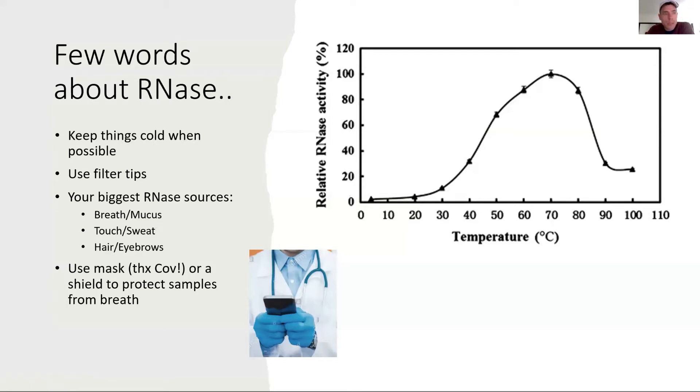For the same reason we use filter tips, because the pipette is blowing in air and ejecting it. If anything is in the air, that will go into our samples. I briefly wanted to touch on the biggest sources of RNase contamination. RNase is part of our breath as well as our mucus and sweat and touch. Believe it or not, there's the occasional hair or eyebrow that can fall in our samples if we don't have one of those protective plastic shields.